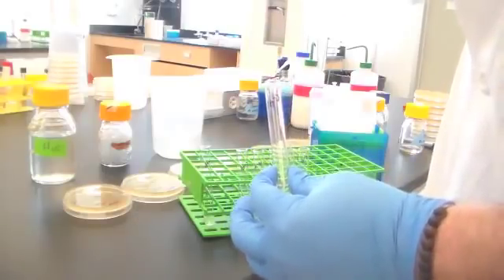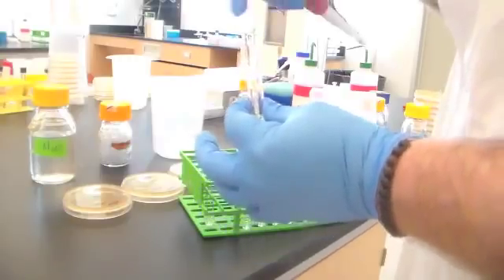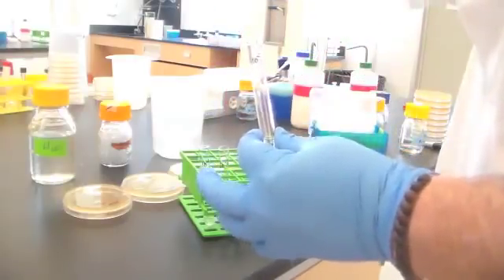So now I'm going in with a new pipette. I'm going to pull out 100 microliters of my 10 to the minus 2, set that aside, put it into 10 to the minus 3.